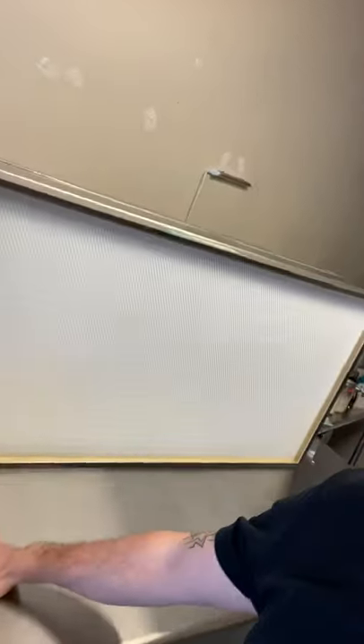This is a food table — a stainless steel food grade table. You can go to any restaurant supply in your area. If not, you can buy them on Amazon, from Uline, wherever. That is a stainless steel food prep table and they shouldn't cost you more than a couple hundred bucks. They are perfect for putting your flow hood on because, as you can see, I get a complete, nice, clean, easy-to-clean working surface. It's also heat-resistant, which will come in handy later when I use the heat gun to seal plates. Anyway, that's a quick explainer under six minutes. Have a good Sunday.